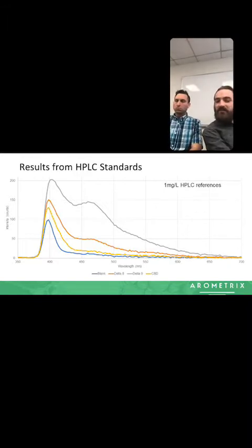On this, you can see that it almost looks like the CBD on this plot doesn't have fluorescence. The reason for that is that CBD does not have a very high fluorescence response, or what we call fluorescence affinity. This doesn't mean that it doesn't fluoresce. In fact, if you have a lot more concentrated CBD, which you can easily buy these days, you'll see that the fluorescence does exist, and it exists at a slightly different peak location than the THC does. But this is what we initially had. We were just trying to see if we could see THC and CBD, and we definitely can.